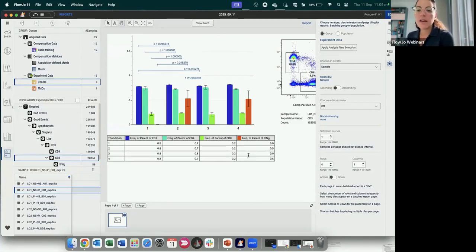That's an interesting question. Hi, Serena. In the charts for the condition keyword, can you select the order 2413 instead of 1234? When I have wild type versus other condition, wild type is always at the end. My suggestion here would be to add a keyword with the order that you prefer. So assign a keyword, for example, order, and name the keyword values with 1, 2, 3, 4, the order that you want to display them. That will help you to display it in the right way.